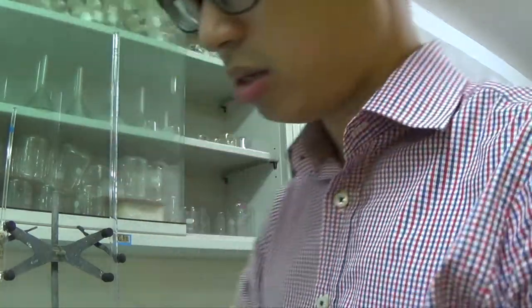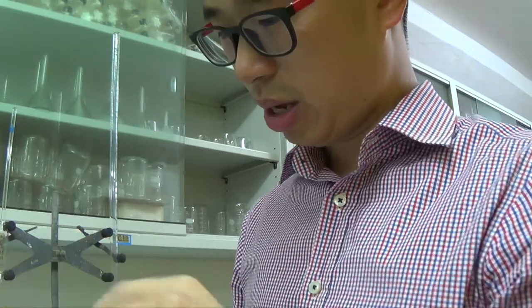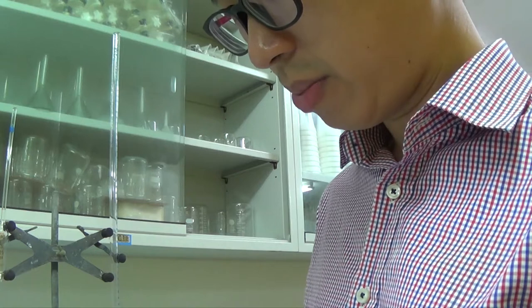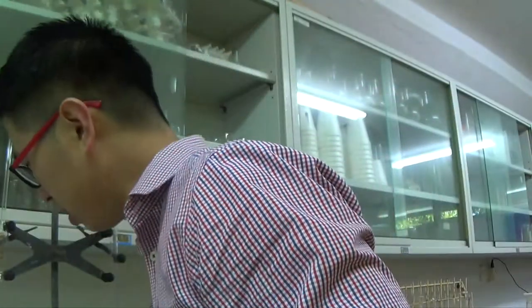This is a particular practical from October-November 2016, for paper 3-2. It's specifically on a titration question, which you can find in the paper. It's basically between an acidified manganese(VII) and an iron(II). So it's an acidified KMnO4 and an iron(II) solution, which has been dissolved in acid.